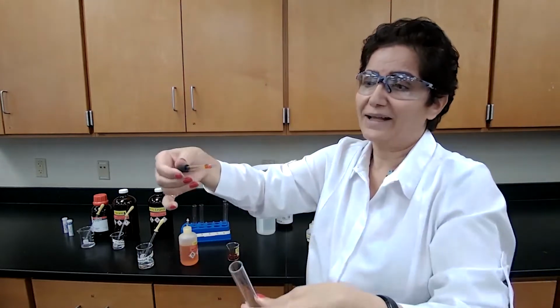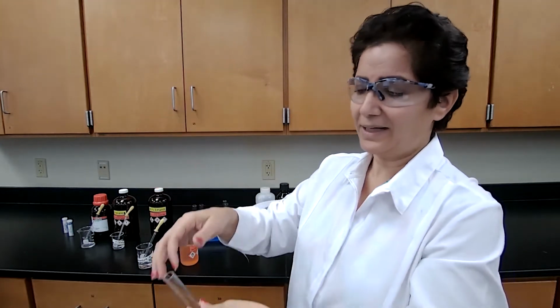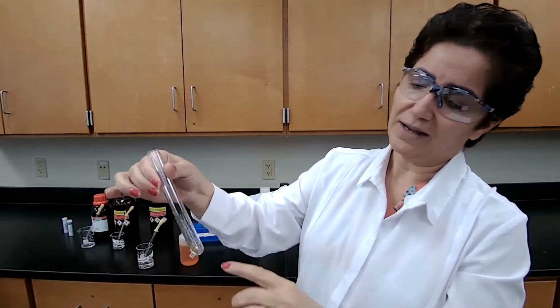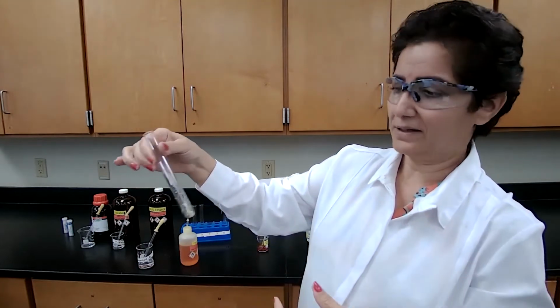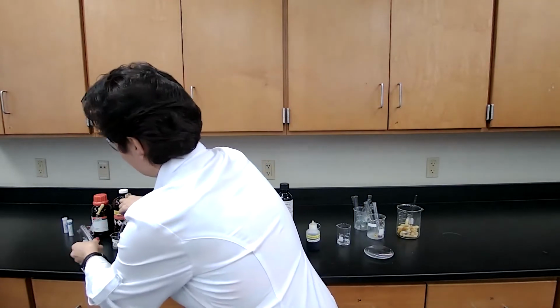If I add too much, it means that all of the pentene has reacted with the bromine, and then the color is going to stay. But the first two drops did disappear. Next compound, I have hexane.